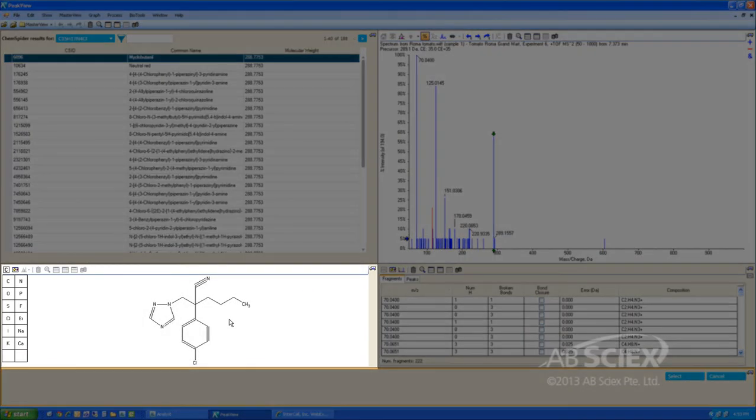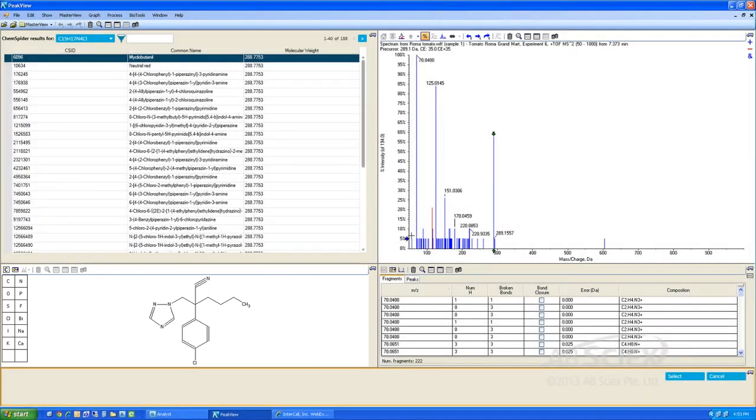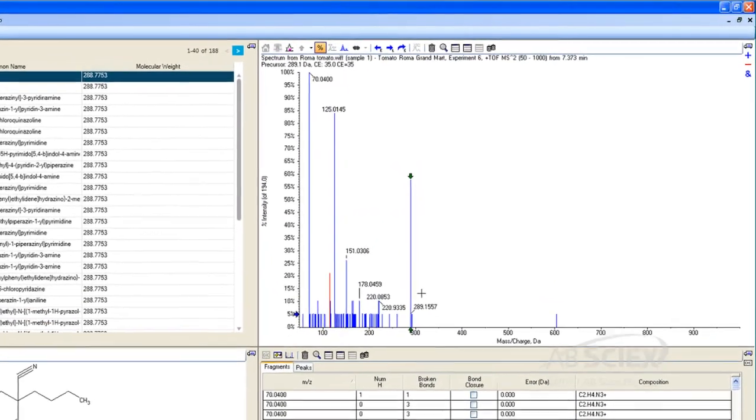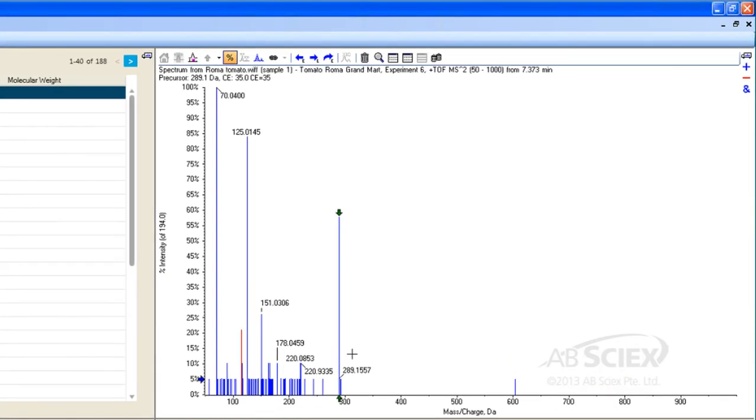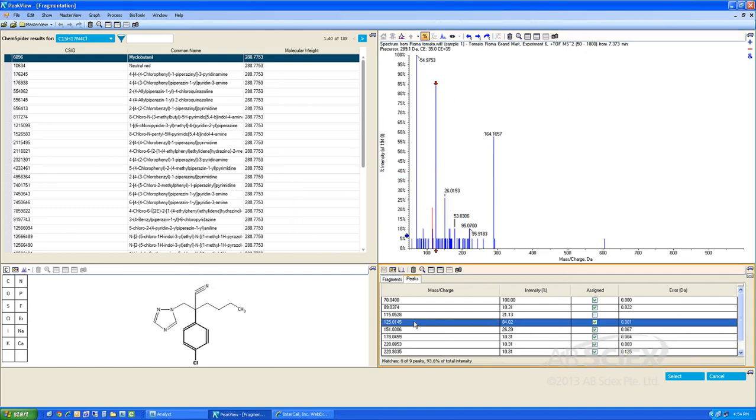The software will then display the chemical structure and calculate the theoretical MS-MS fragmentation pattern for that structure, and compare it to the acquired MS-MS spectrum we collected in our analysis. All fragments that can be explained by the identified structure are shown in blue, and those that are not explained by the structure are shown in red. From this analysis, we can see that 94% of the MS-MS fragments that we acquired in our analysis can be explained by the structure for myclobutanil. We can also click on any fragment mass, and it will highlight which part of the molecule gives rise to this fragment.